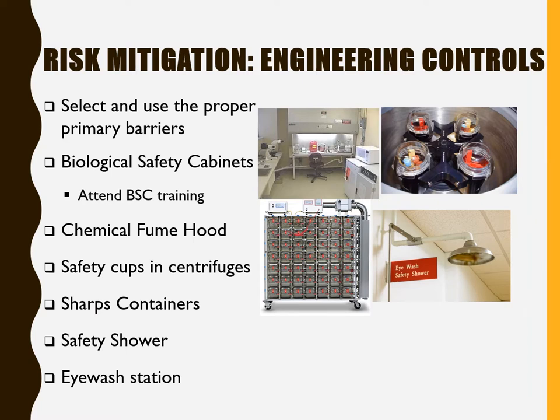Examples of engineering controls for risk mitigation: selection and use of proper primary barriers including biological safety cabinets, chemical fume hoods, safety cups in centrifuges, sharps containers, safety showers, and eyewash stations.